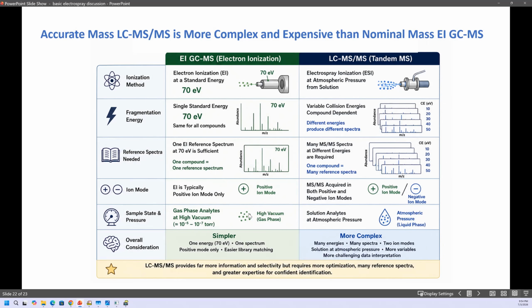The other thing about EI: if you run an EI chromatogram, you scan the full spectrum, the responses are somewhat related to the concentration. In electrospray, you can't really count on that. The responses are so much different depending on how effective this evaporation is for the class of compounds that you have. So it's just very hard without getting a standard to quantitate in electrospray. You might use a UV detector and have similar things in the sample, and you could use the UV detector that was in series with the electrospray. But by itself, it's difficult to get an idea of even relative concentration as an approximation.